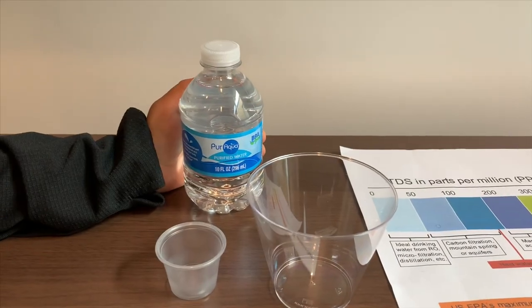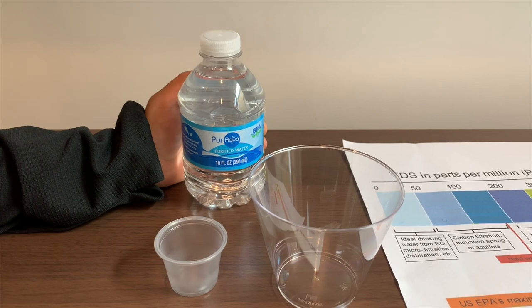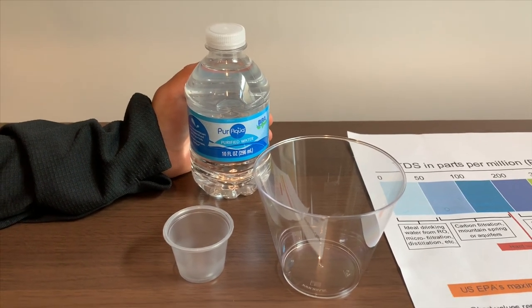This is Pura Aqua Purified Water. We bought it in a pack of 24 at Omdi. It costed $2.49. Let's test the pH and TDS levels.